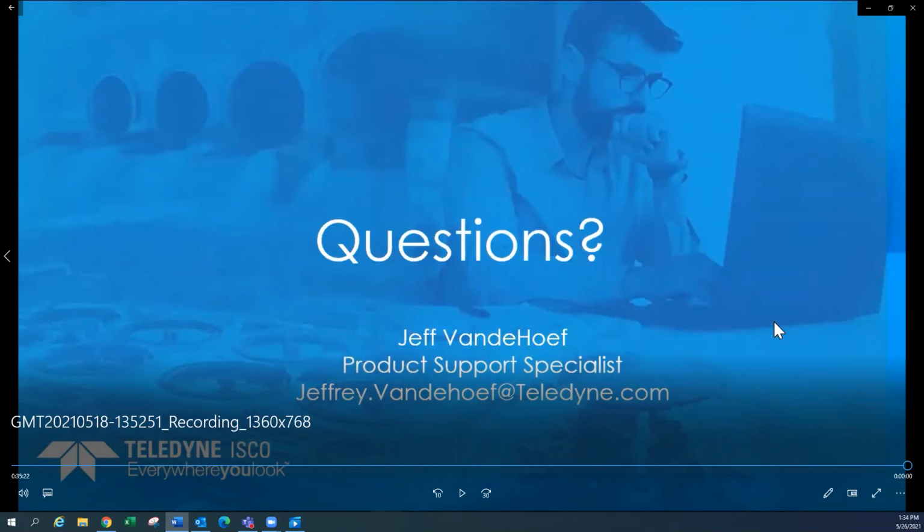Yes and no on that question. The liquid level actuator is the device that goes down into the water, into the flow. When water makes contact with the sensor, that could start your program. There are two different modes to the liquid level actuator: a latch and a toggle mode. If you have it in toggle mode, then whenever water is touching that sensor, yes, the program's going to run. As soon as that water goes away and it's not touching that sensor, that will disable the program and cause it to stop running.